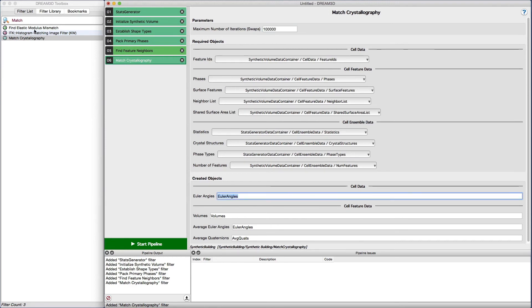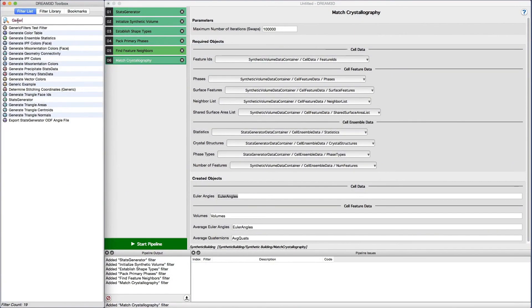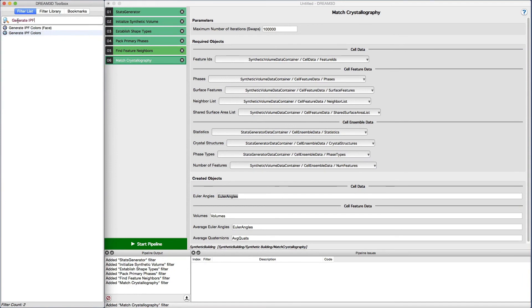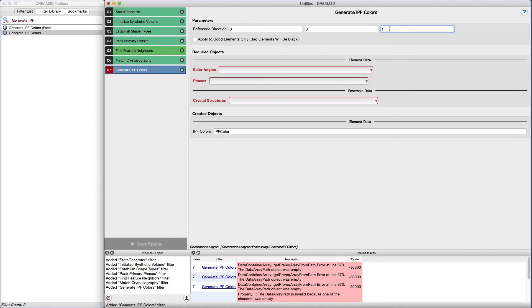The next filter to add is the generate IPF colors, which will use the standard inverse pole figure color scheme for a cubic material. Set a reference direction of 0, 0, 1 and then select the Euler angles, phases, and crystal structure attribute arrays.